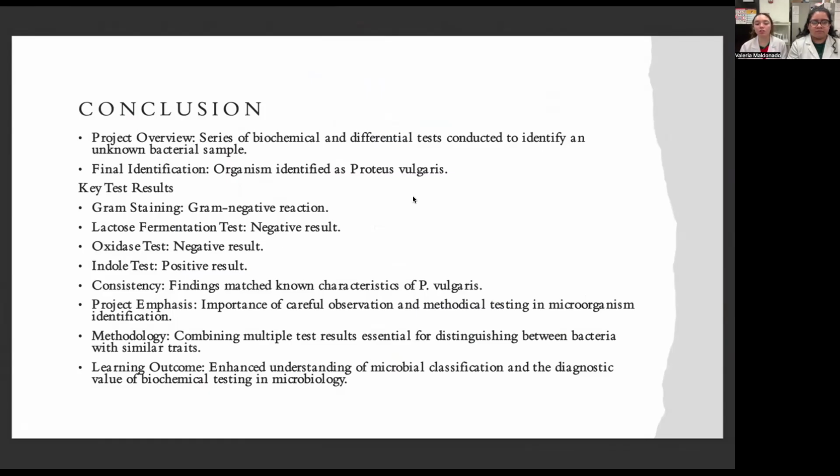The emphasis of this project is careful observation and methodical testing of the microorganisms, and being able to identify them. Combining all these tests helps us distinguish the differences between bacteria, even if they have similar traits. What we learned is how to enhance our microbial classification understanding and biochemical testing in microbiology.